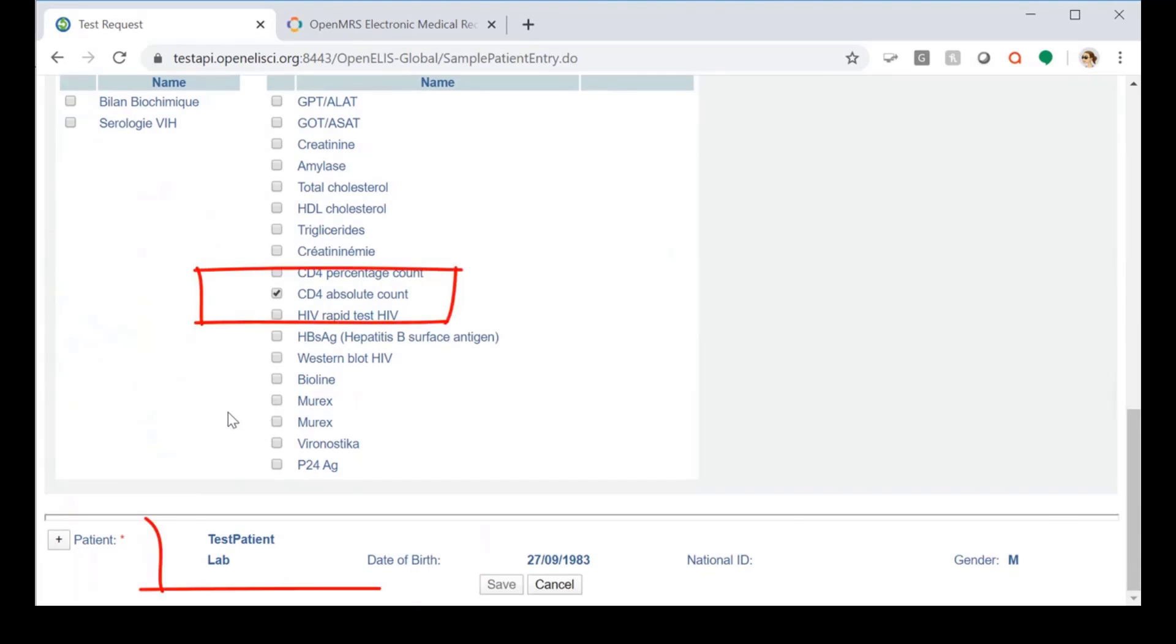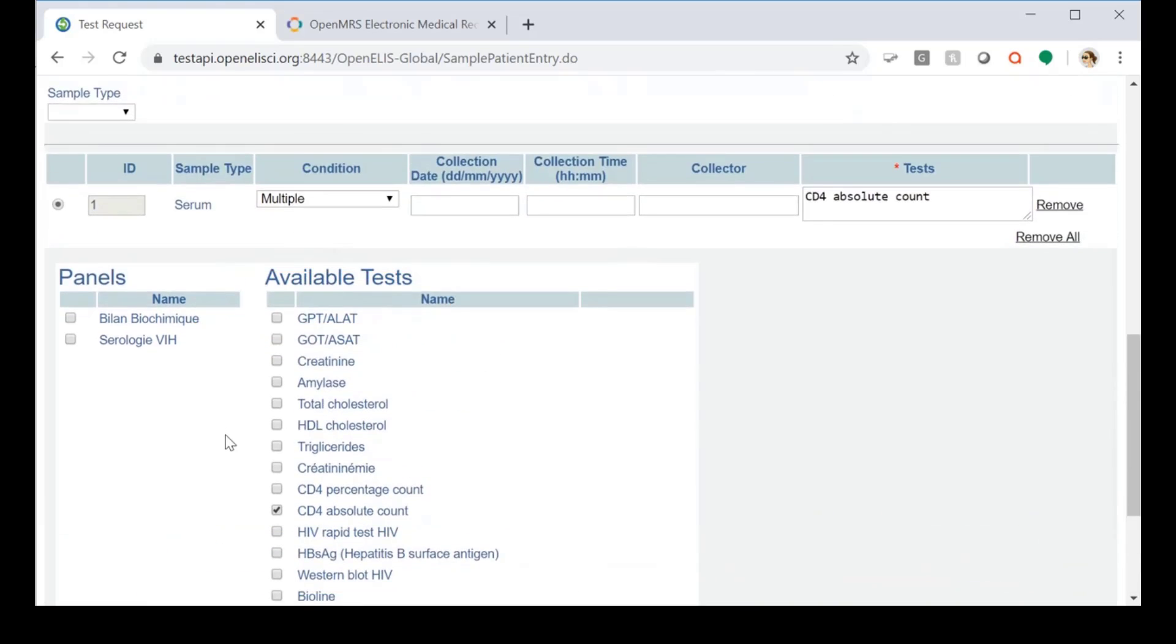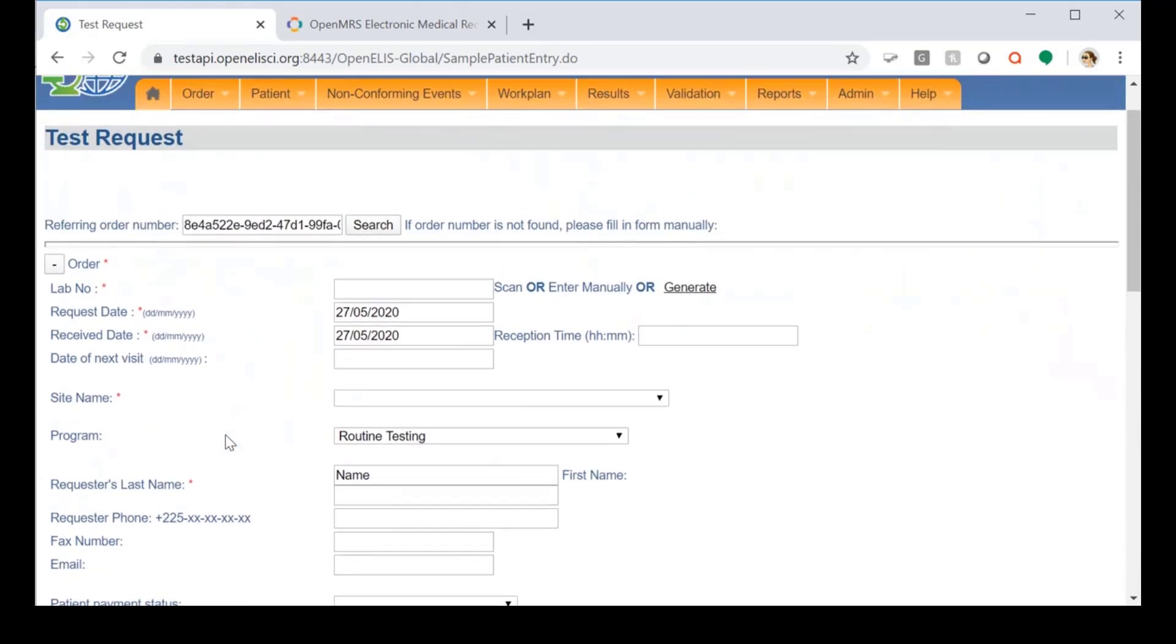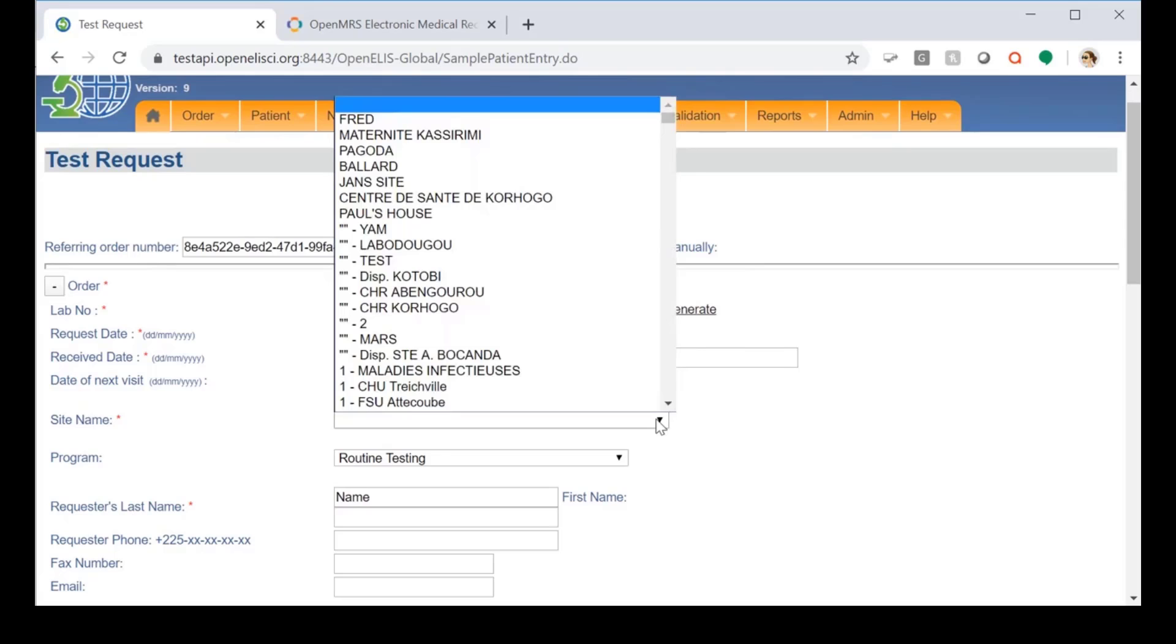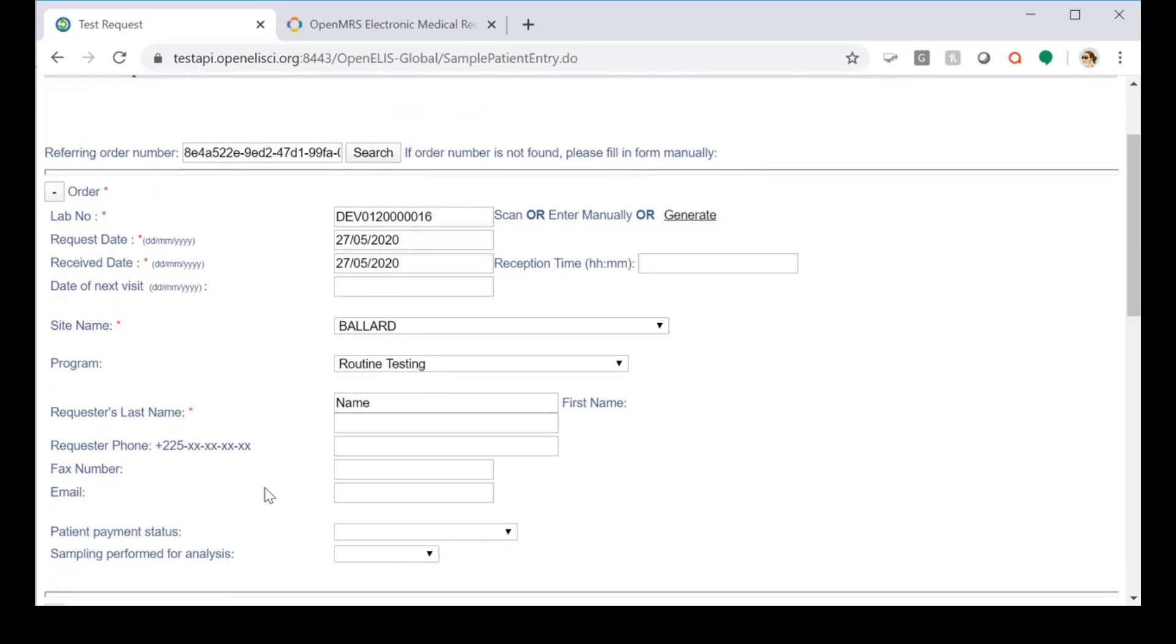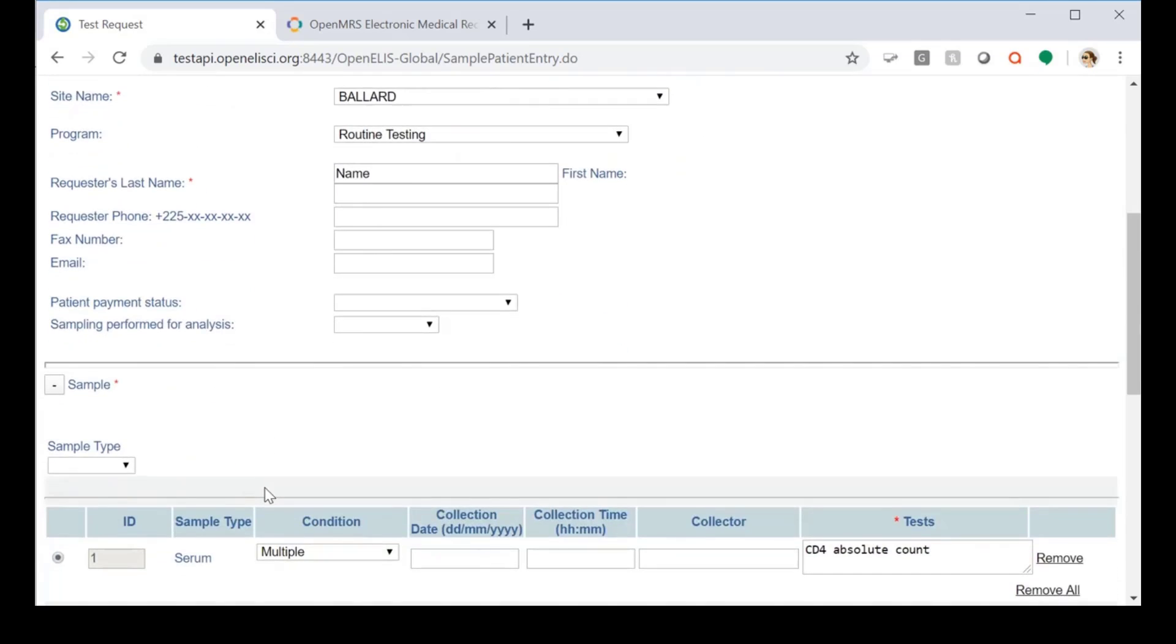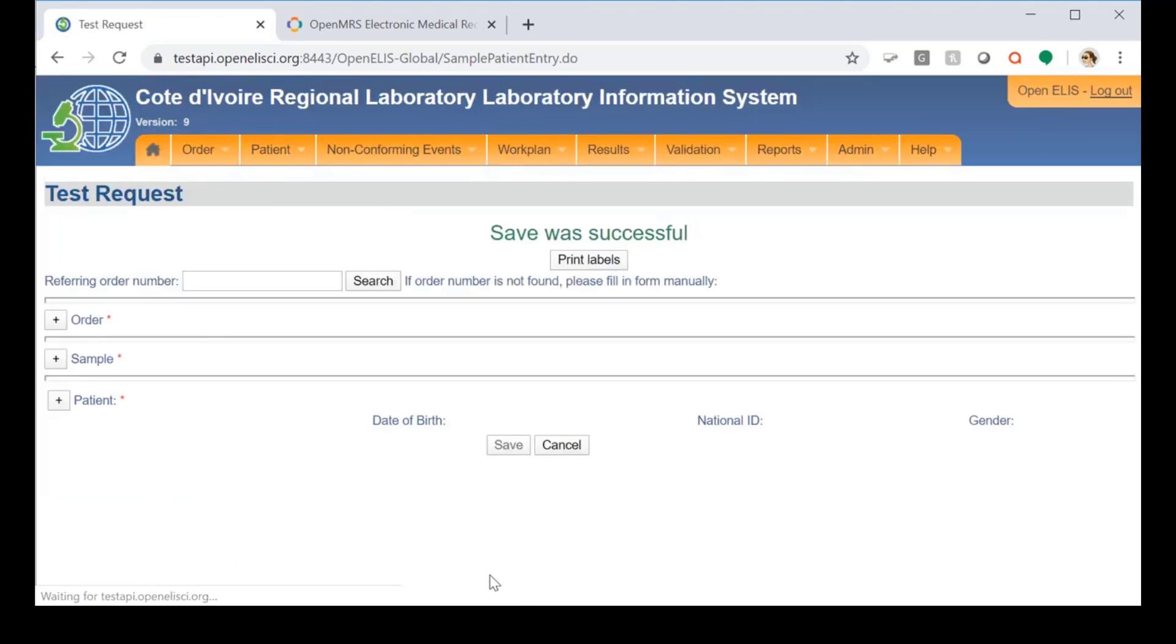As you can see, the test information and the patient information from the electronic order are displayed. We'll generate a lab order for processing of the sample and we'll select a site and then we'll save the order for processing.